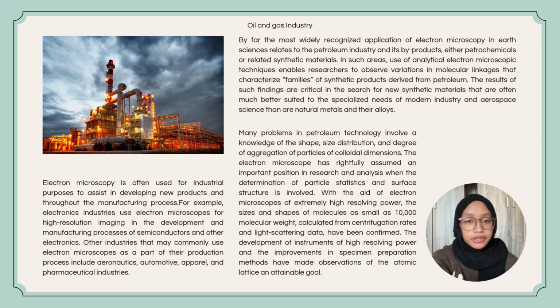Many problems in petroleum technology involve a knowledge of the shape, size distribution, and degree of aggregation of particles of colloidal dimensions. The electron microscope has rightfully assumed an important position in research and analysis when the determination of particle statistics and surface structure is involved.